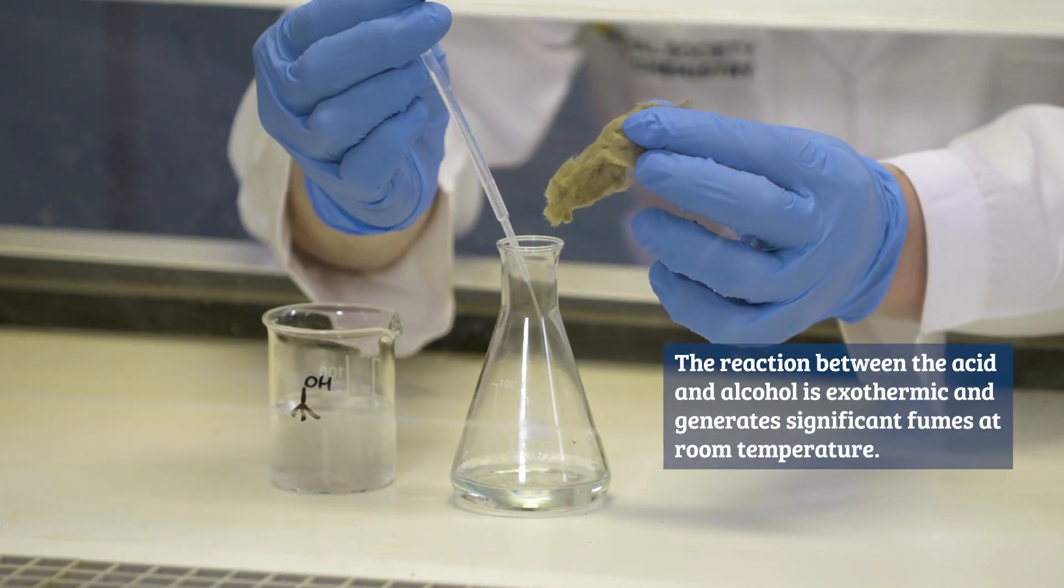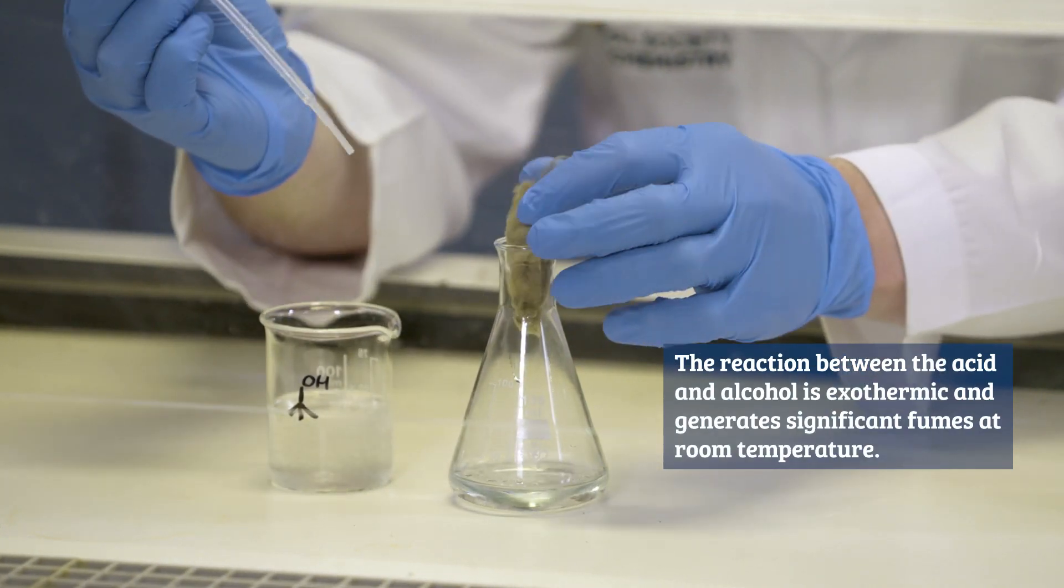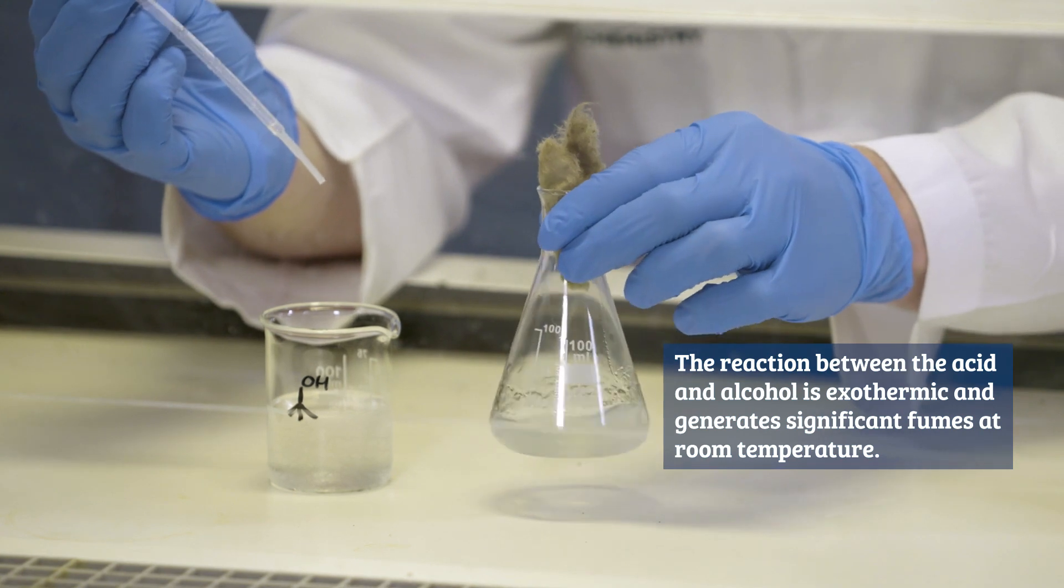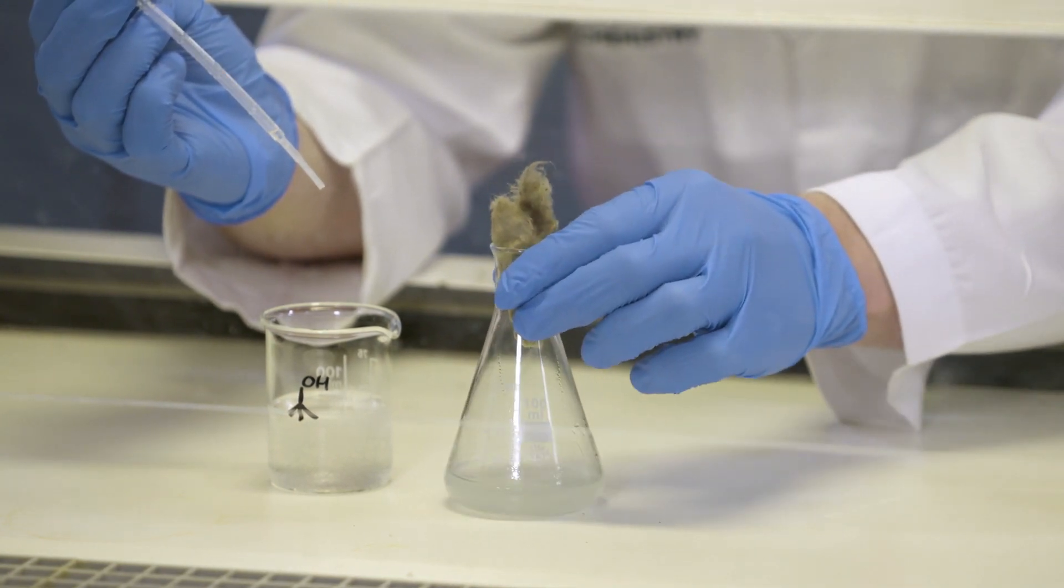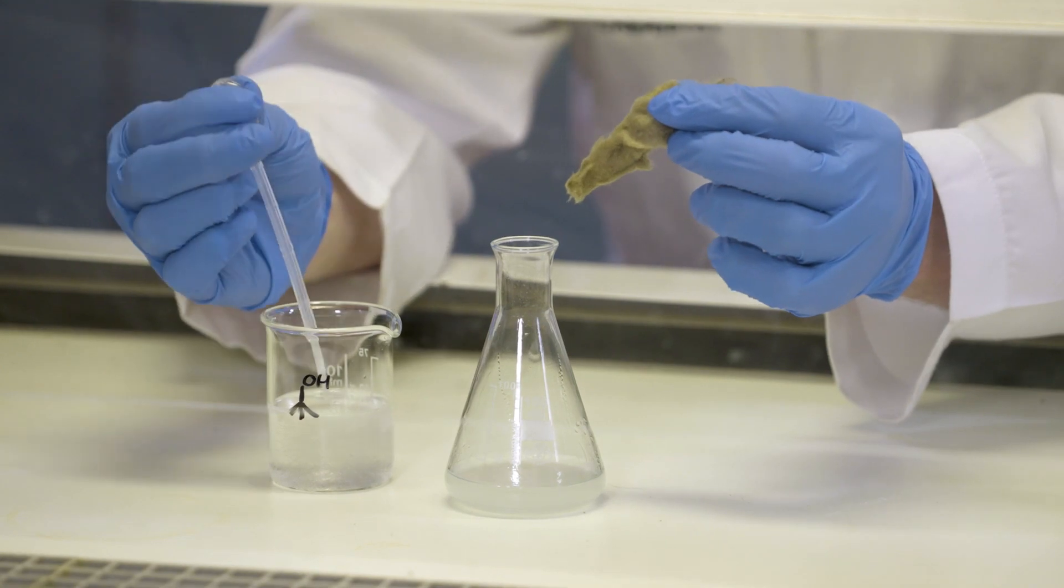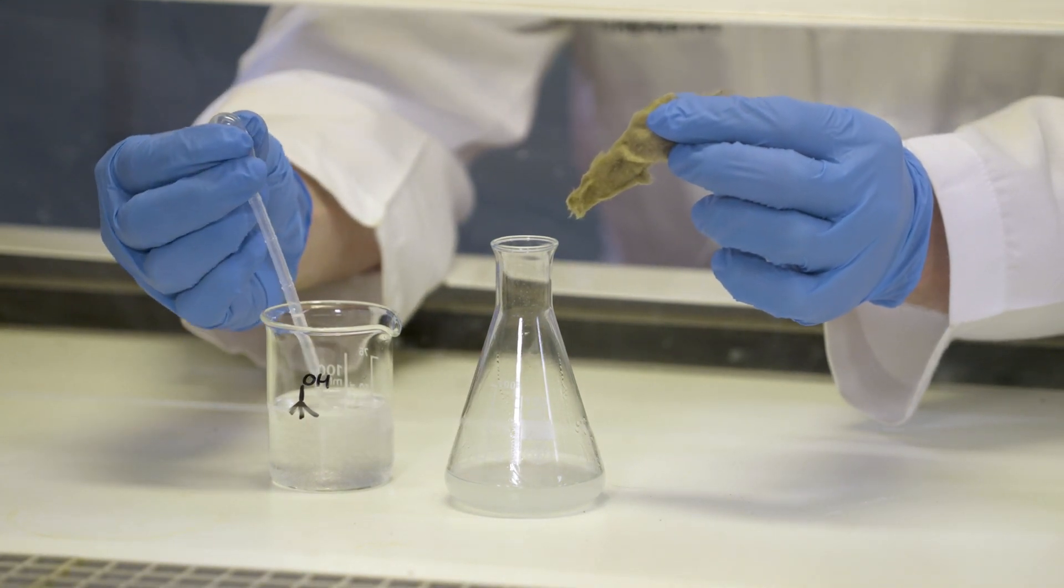Now, I will gradually add around 6 centimeters cubed of the 2-methylpropane 2-ol to the conical flask, 1 centimeter cubed at a time. Replace the plug and give a swirl after each addition. This will take a couple of minutes.